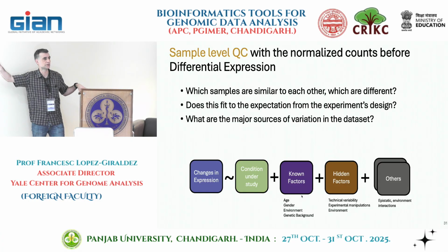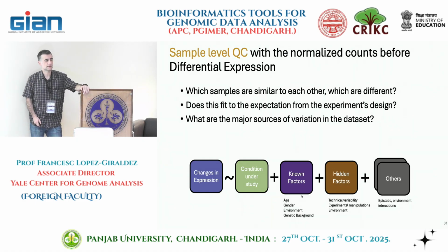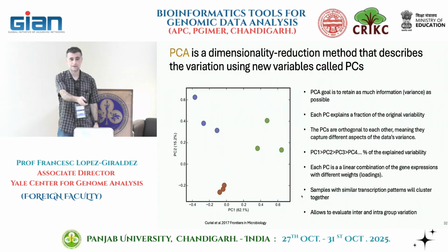Anyone here know how we can answer these questions, doing, let's say, a preliminary QC analysis? Did anybody here do RNA-seq analysis before? We look into the changes in the values, like the intensity. Whether they are falling into a similar range, or whether the differentially expressed genes are the same kind of genes. Well, that could be a way, I guess. There's a simpler way, though. PCAs? Anybody has done a PCA before? Okay. Then they will fall into certain categories, yes.